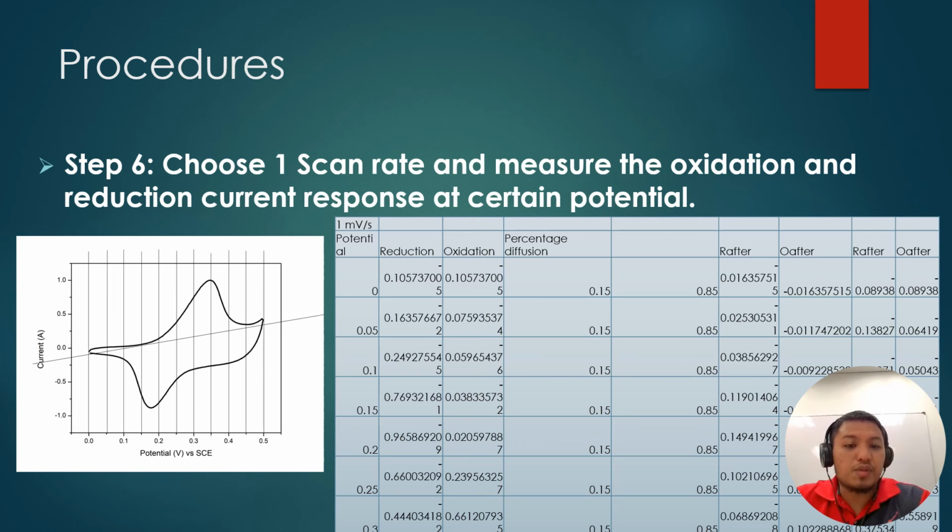Then the value at 0 volt should be only 15% of the initial current. For example, at the same point 0.1 should also be 15% of the original current. So you get a dot that has a lower amount of current, not 100% but only 15%.